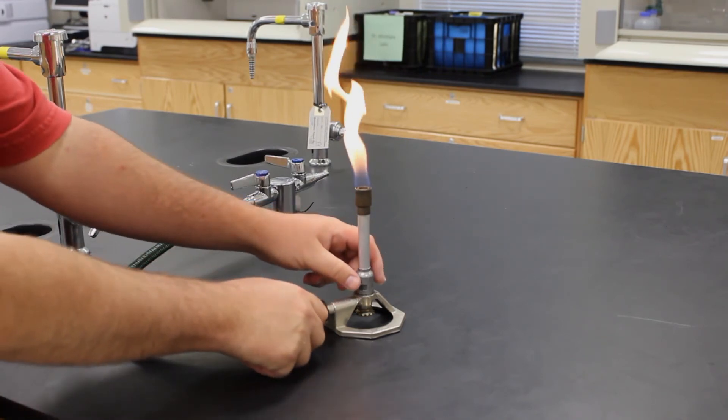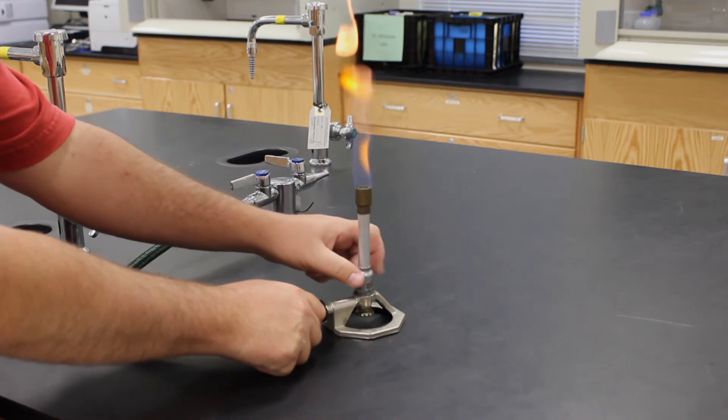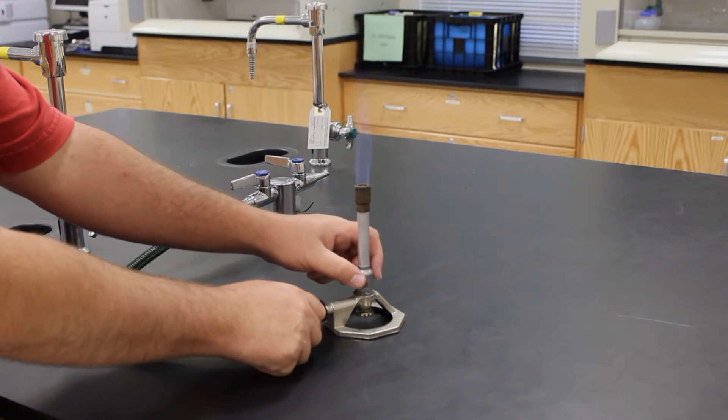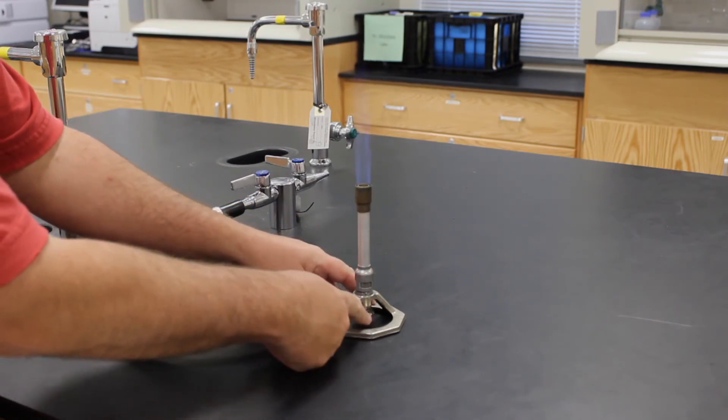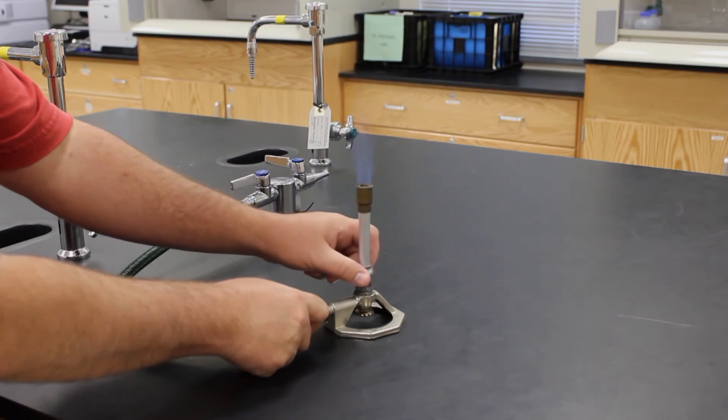Adjust the needle valve first if needed so you have a flame that's about four inches high. Then adjust the air ports so you have a blue flame with an inner cone. At the end, you may have to readjust the height of the flame and or the color of the flame.